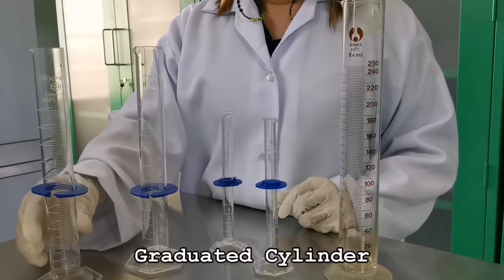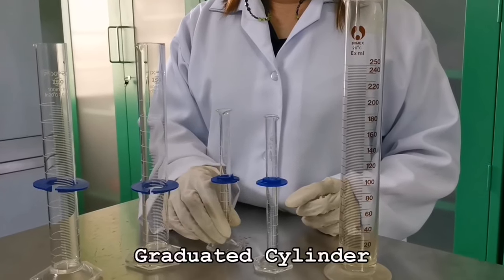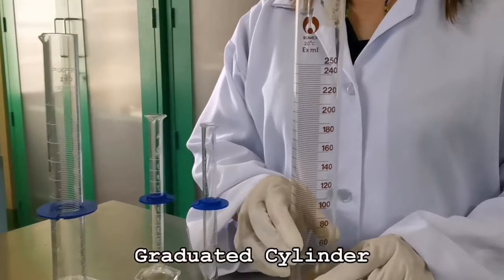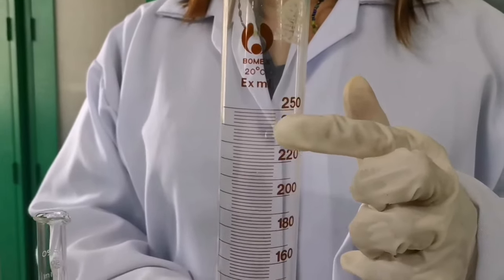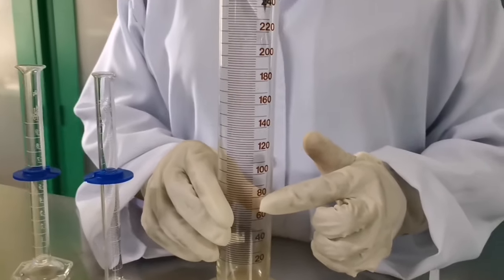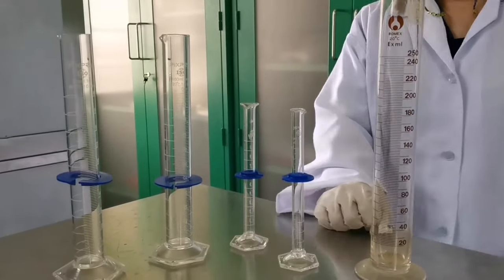Graduated cylinders are long, slender vessels used for measuring the volumes of liquids. Graduated cylinders are used to make fairly accurate liquid volume measurements. We can get a pretty good idea of how much volume we have if we read it correctly.